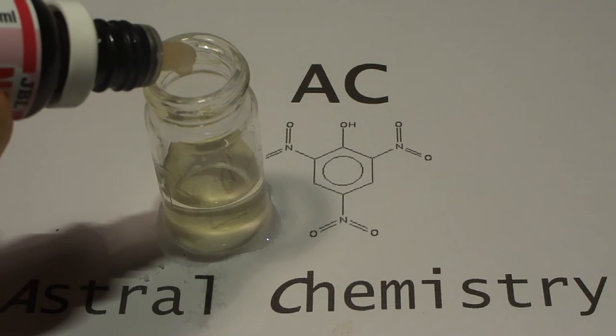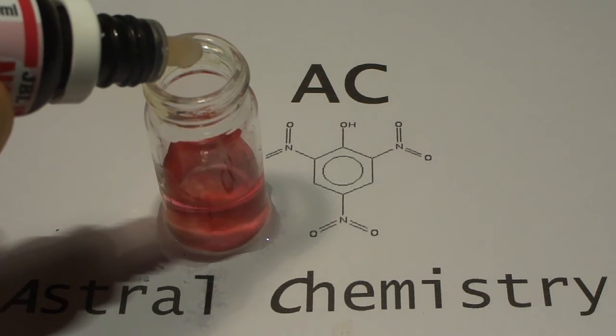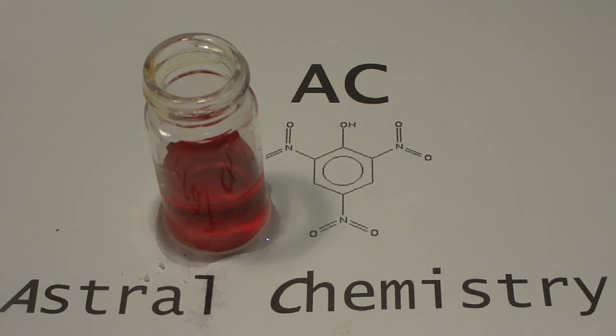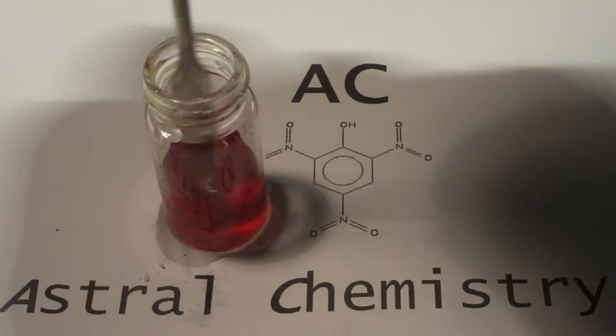This creates the diazonium salt we talked about. Now, we add a few drops of a 1-naphthalamine solution. The color of the test solution instantly turns a nice red color. However, the red dye can actually be extracted from the solution with an organic solvent like DCM.